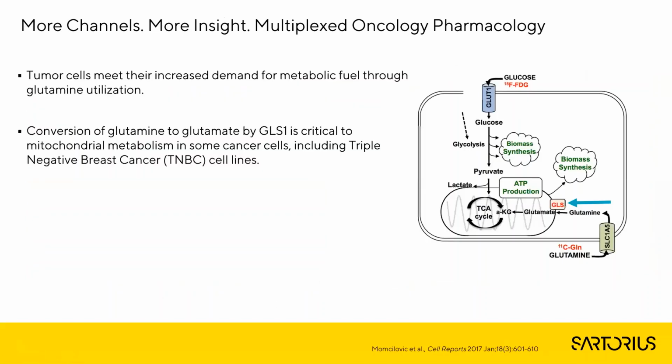Okay, so I've talked about immune cell killing, a simple immune cell killing application at first, then one utilizing our new cell cycle sensor. Now I'm going to switch gears a little bit and talk about tumor cells and oncology. So apologize for the rapid change in topics here, but I hope you can follow along.